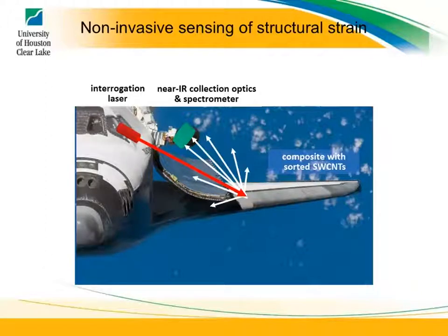Right now we're tip-sonicating the nanotubes and the polyurethane at the same time. We know that breaks apart the nanotubes. We don't know if it does anything to the polyurethane, if it changes its properties. So that's another thing that we're kind of working on. But if polyurethane can be put on it, and it will withstand it, then I think there's no reason why we couldn't do this there.